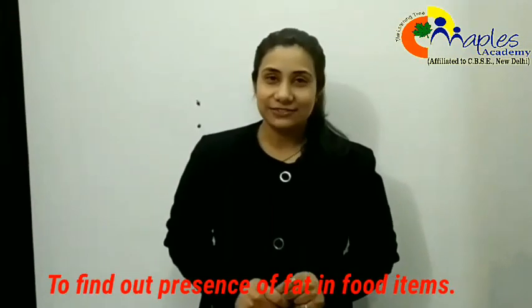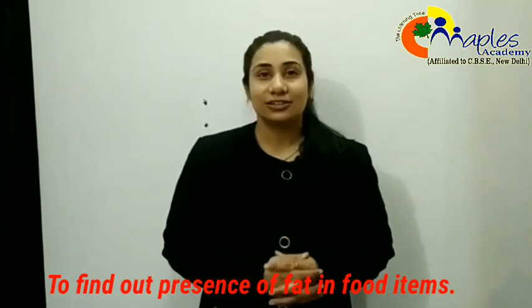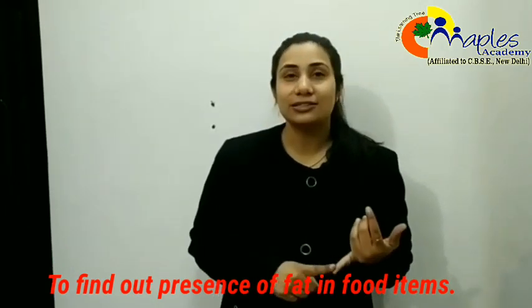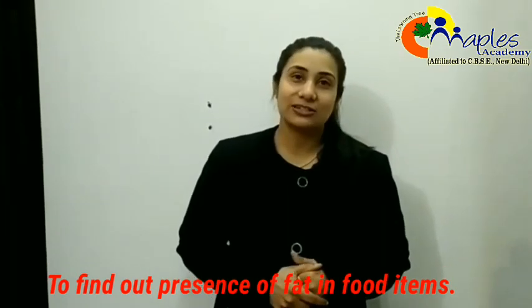So from this activity we can conclude that some of the food items contain fats. You can try it with other food items as well, by taking rice grains and gram seeds, and check whether they have fats present in them or not.